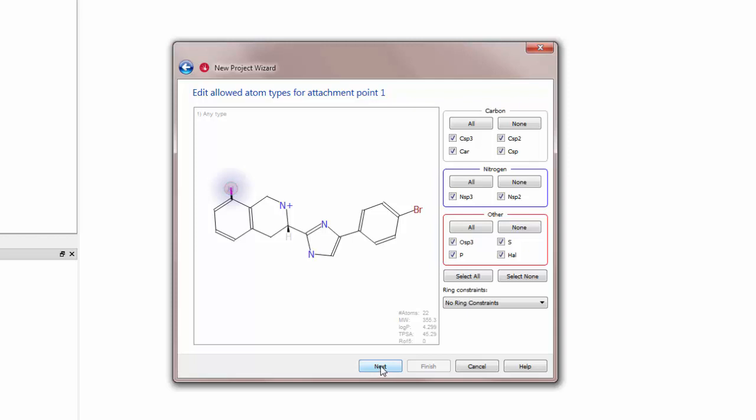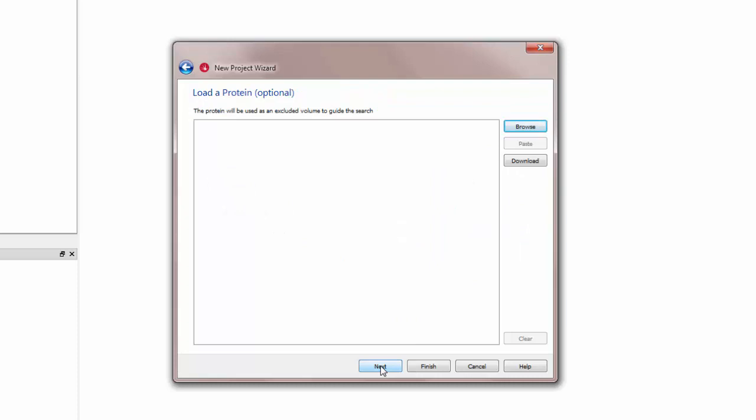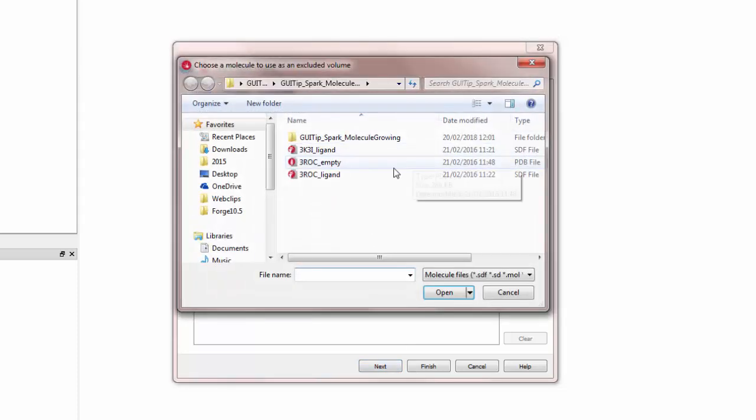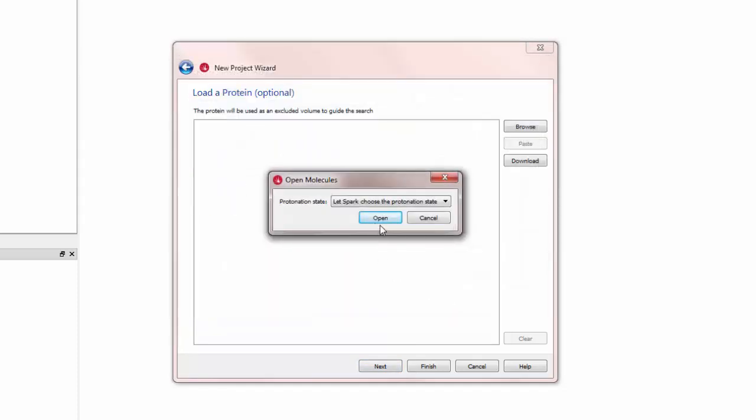Next I can load a protein structure. I will load 3ROC empty, import it as a protein and then click finish.